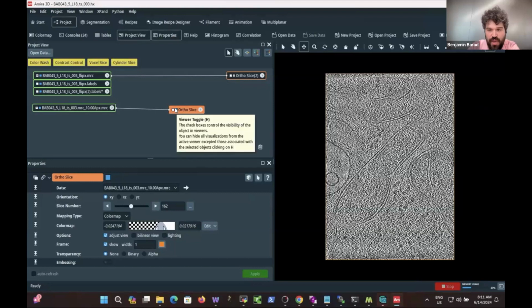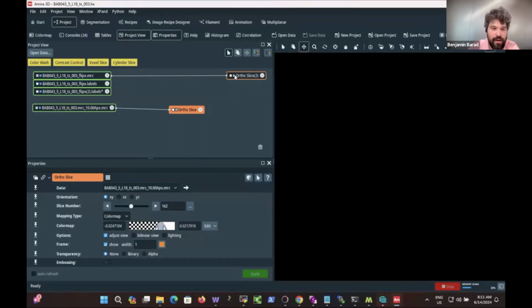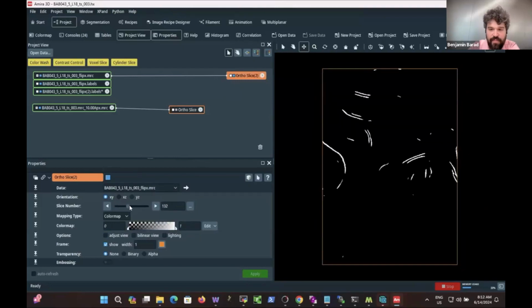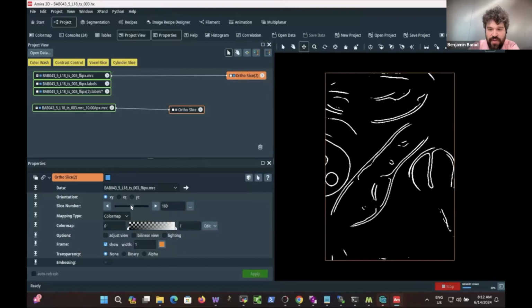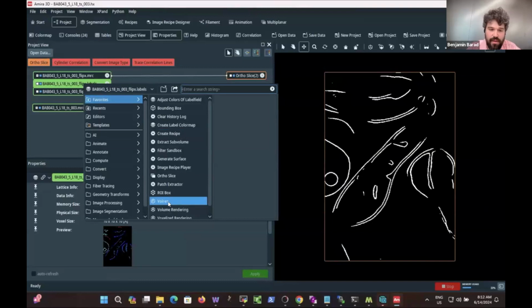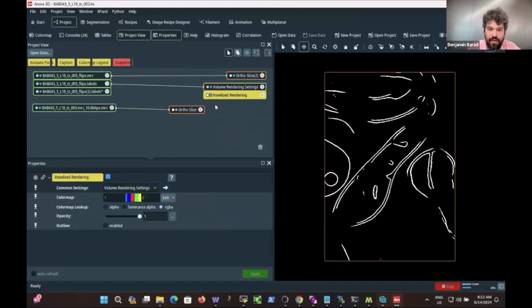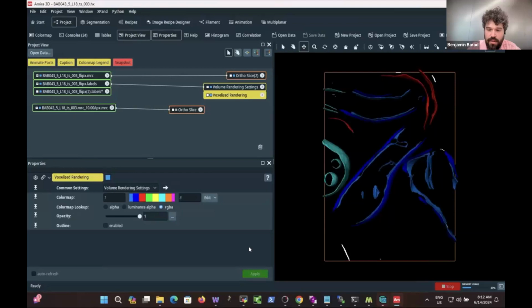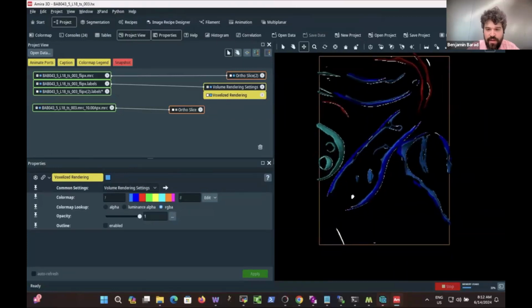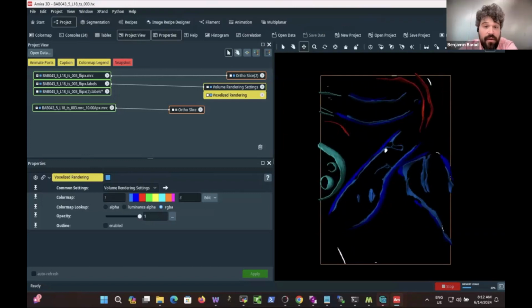So we've seen this, and now I want to show you what membrane looks like. This membrane structure was generated in about 5 minutes with no cleanup prior to this. So rather than having huge amounts of noise, now we're able to scan back up and down and see almost perfectly just our features of interest. Let's do voxelized rendering. Now you can see this is the completed segmentation. I don't think I'm going to have time to complete the whole thing, but it basically snaps into this beautiful structure, and there are only a few places where the membranes that were segmented aren't real.